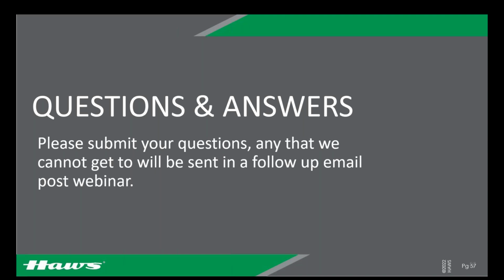Yeah, so our first question, I really like it. It is a little bit longer, more like three questions, but I'm going to go through it real quickly. What would require an eyewash to have tempered water, and what temperature should it fall between? Is the temperature of the water due to potential chemical reactions to different temperatures of water? And is a 15-minute flush time required on weekly inspections? I picked this one because we saw it asked quite a bit throughout this webinar, and it's a good way to summarize all three in one.